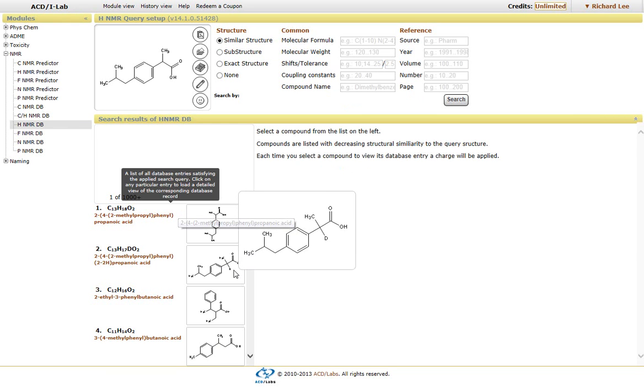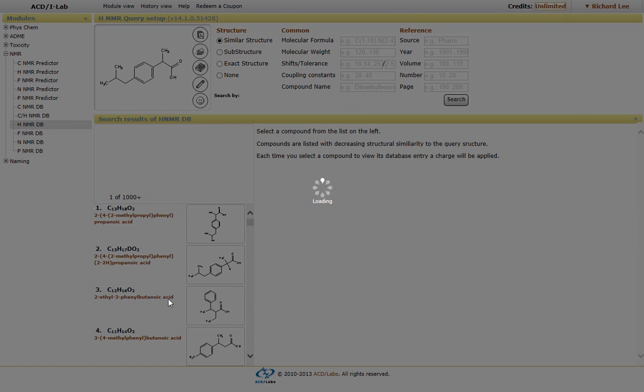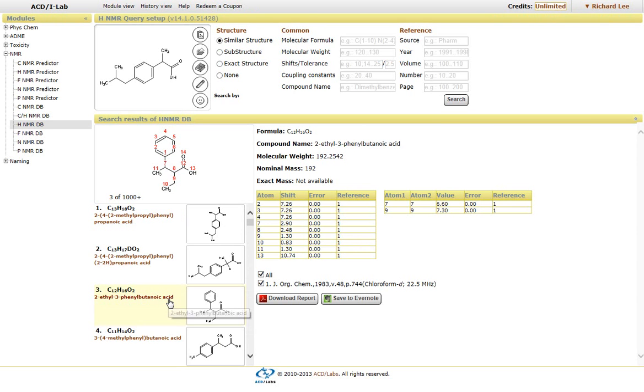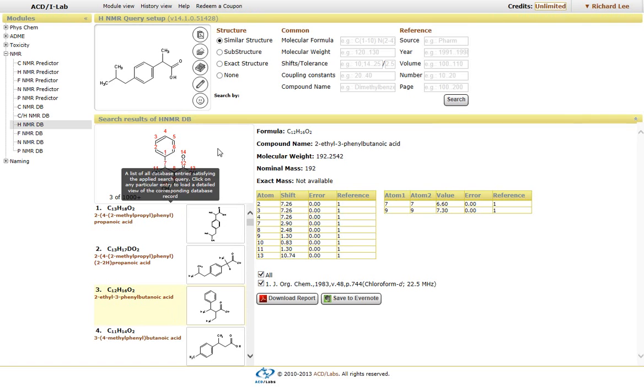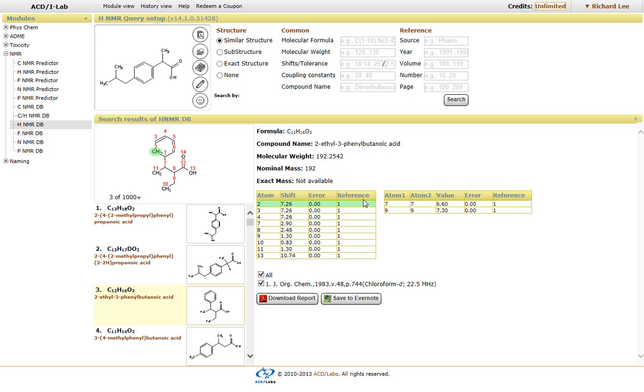But again, if I just simply click on the name, it will bring up the associated structure of the search, as well as the name of the compound, the molecular formula, as well as the chemical shifts for each of the protons.